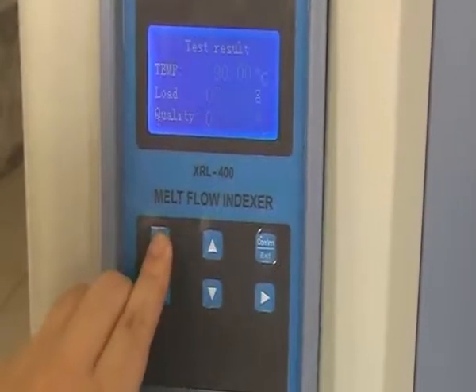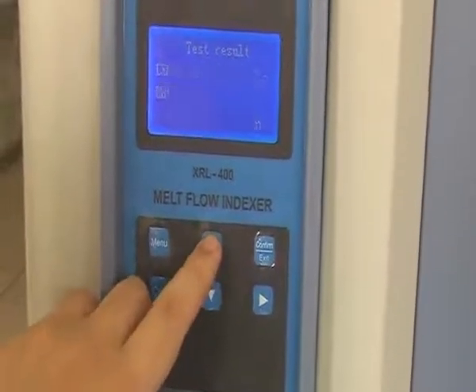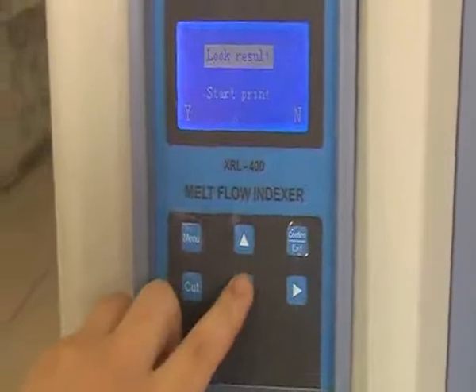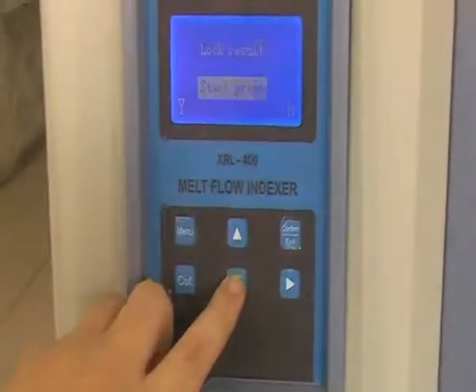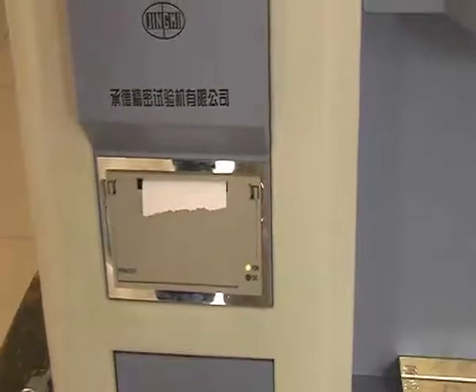Press up and down keys to select how to output the test result. If you just want to check the result, press menu. If you want to print the result, select it, then press menu — it will print automatically.